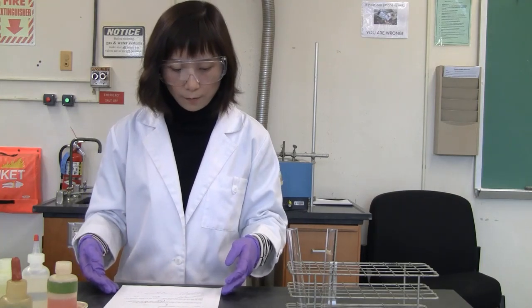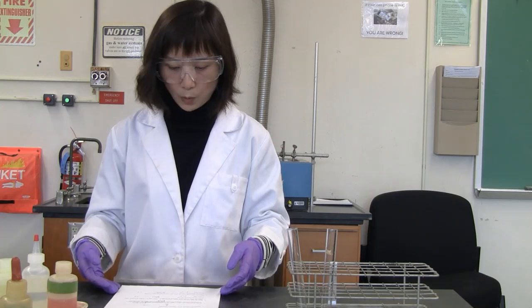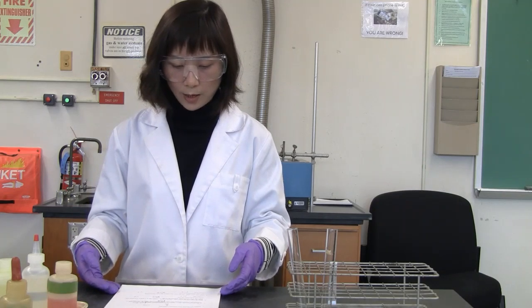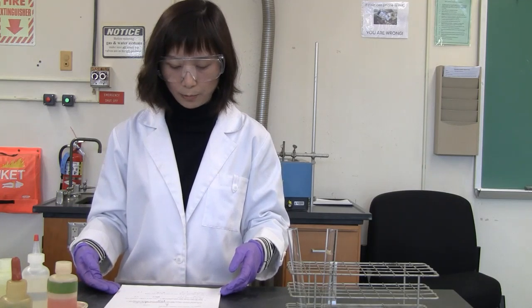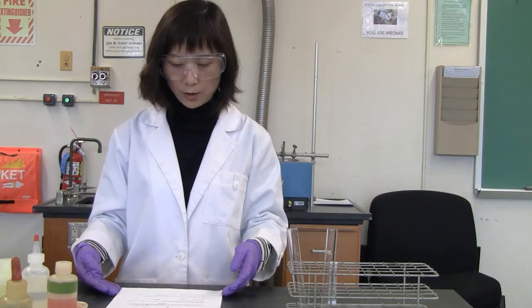Okay, part 5, cobalt chloride. So you can see the equation still. On the left side you have pink color, on the right side you have blue color. So this time you're going to observe the pink and the blue color change to decide the shift and explain why.